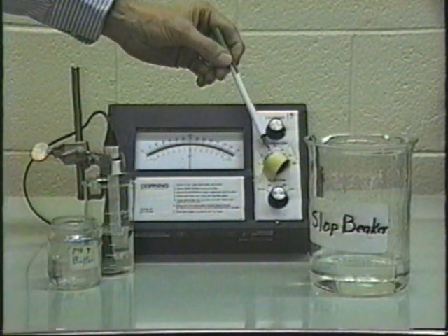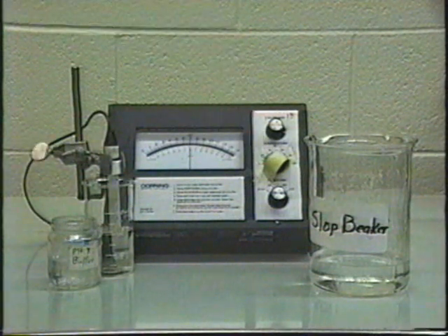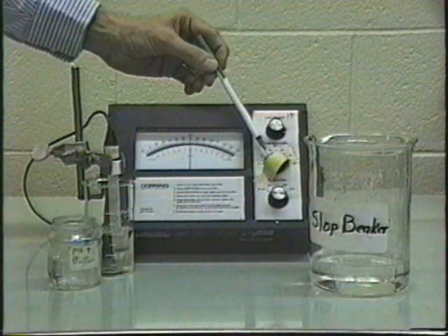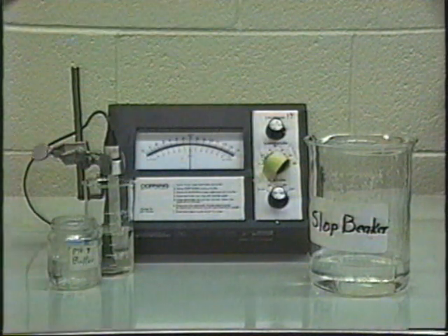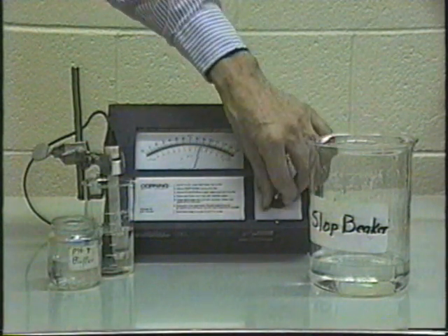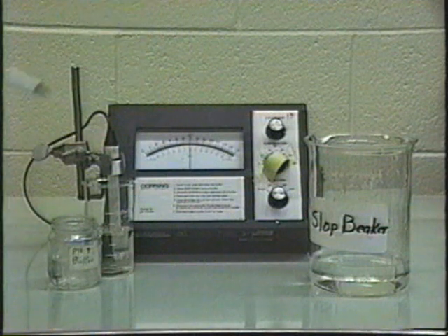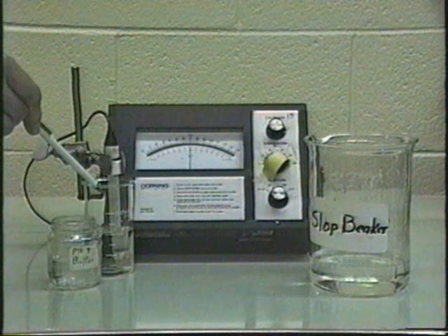The second knob here is called temperature, and it allows a second point of calibration for your pH meter. Do not touch this knob because it has been set for you by the instructor. The third knob down here is essentially an on-off switch. If you want to read a pH, you turn it to pH. If you want to then do something with the electrodes, you turn it to standby. The pH, of course, is read on the meter here, and the pH is sensed with the electrodes here.